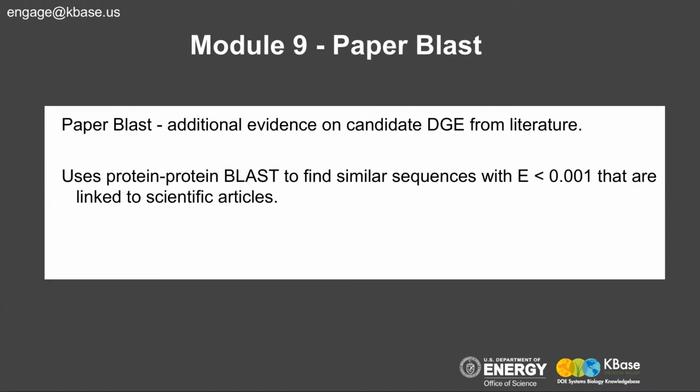In addition to that, we also provide another app called PaperBLAST, which gives additional evidence on the candidate differential gene expression from literature. It uses protein-protein BLAST to find similar sequences that are linked to scientific articles.